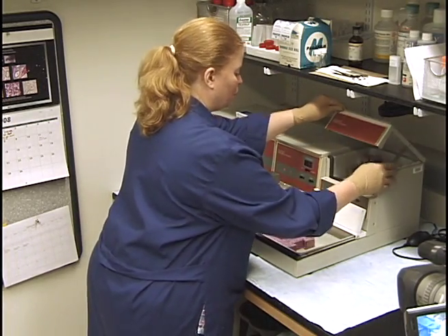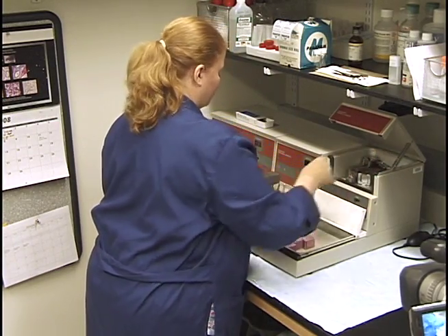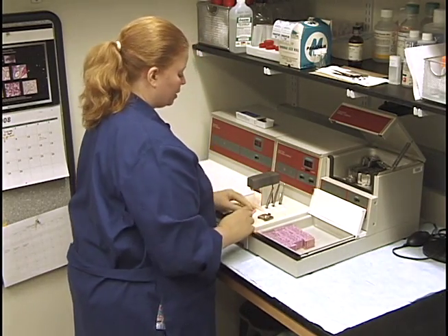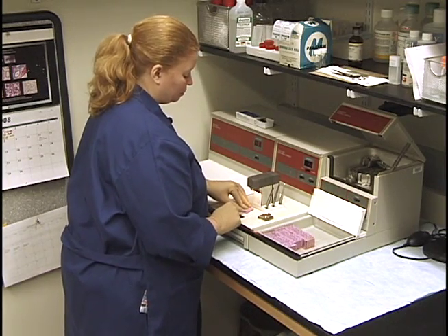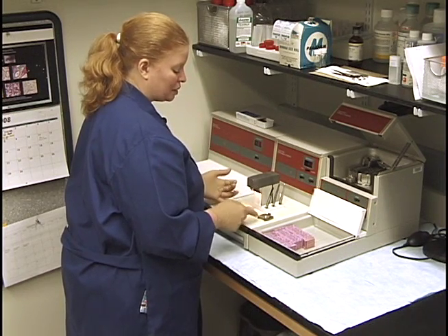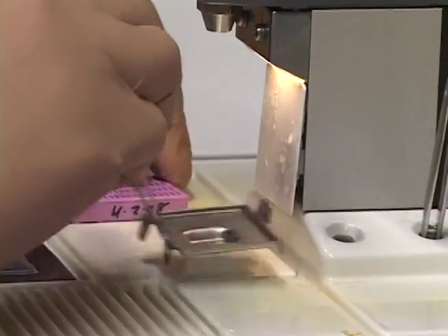I never open more than one cassette at a time, and if you heed that rule it will save you someday. The reason is that if a little sample jumps out into another cassette — which can easily happen — you won't know which cassette or what tissue was in that cassette. To avoid that, just only open one at a time.